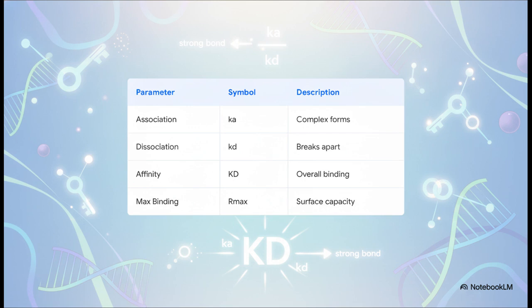This is the ultimate big picture measure of overall binding affinity. Is it a strong, tight bond or a loose, weak one? The data here gives us the complete fingerprint of a molecular relationship.